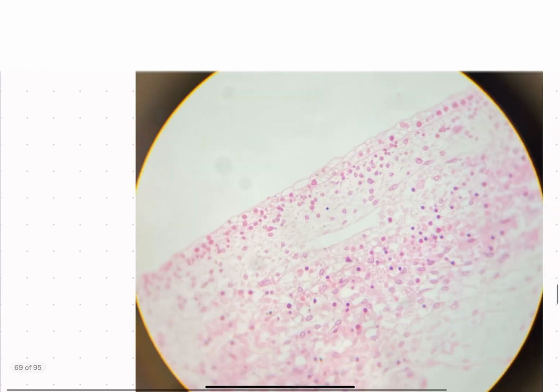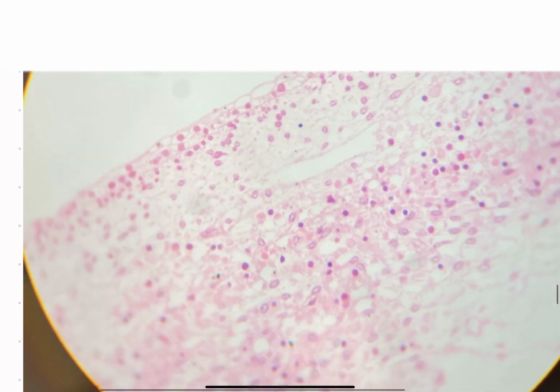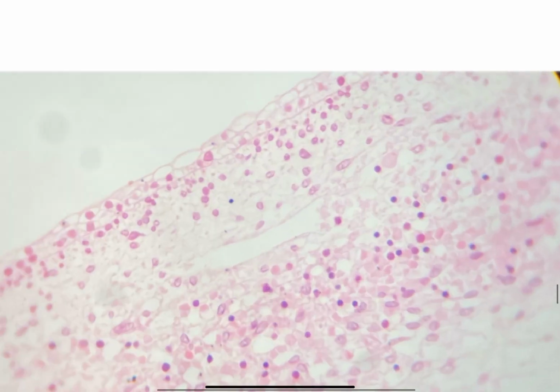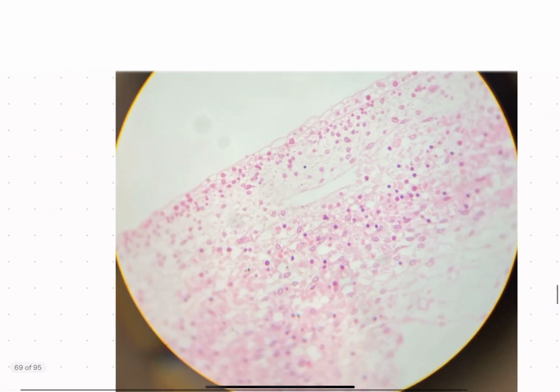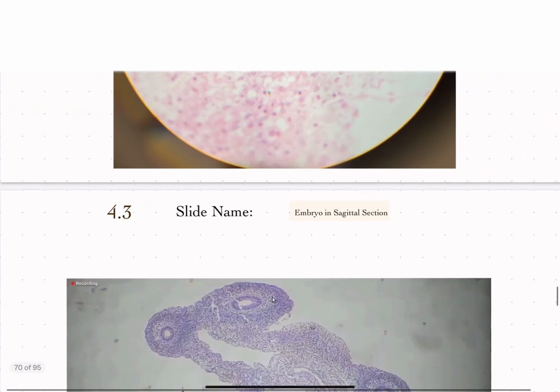So I was a little bit scared that you would write down that instead. So I was trying to show you guys something more elongated. A little bit of a failed mishap on my side, but hopefully you guys got it anyways. Like I said, if it's a blood vessel looking structure with no blood cells, and we're in the database, it's the lymphatic vessel. This would be more of a clear answer, but it's very blurry.